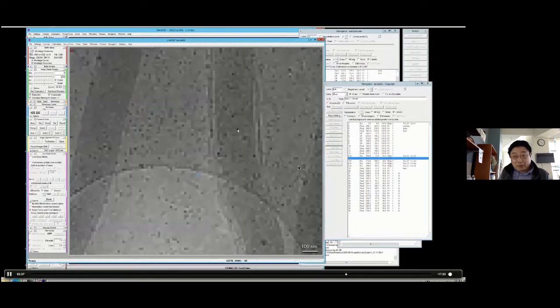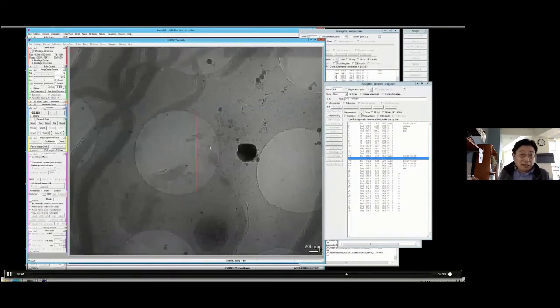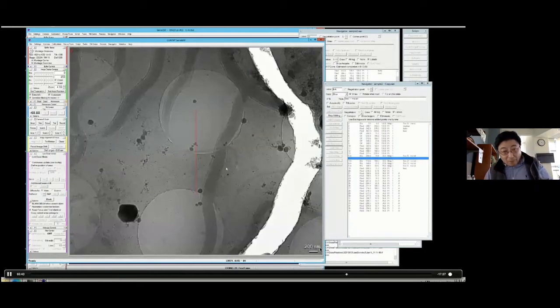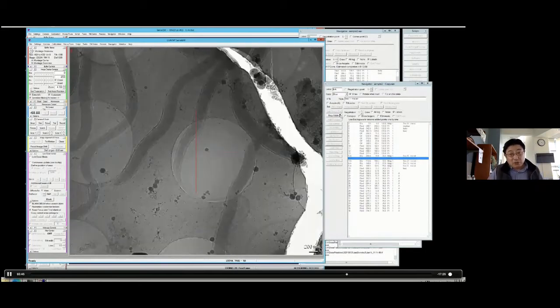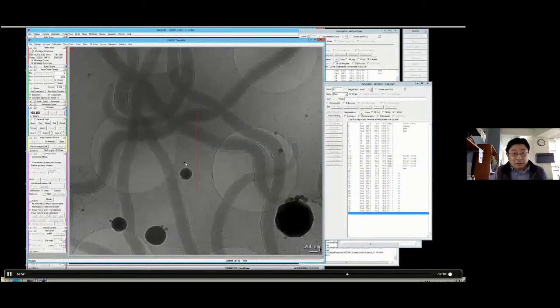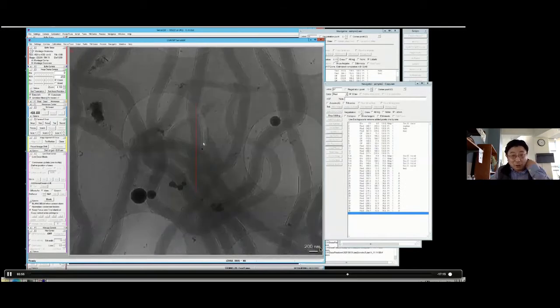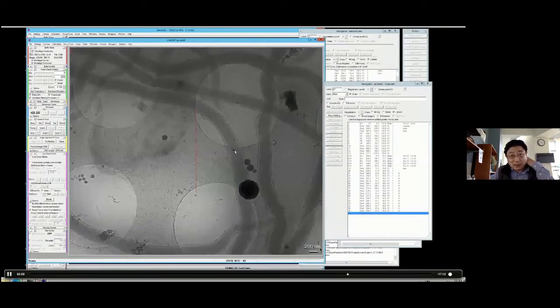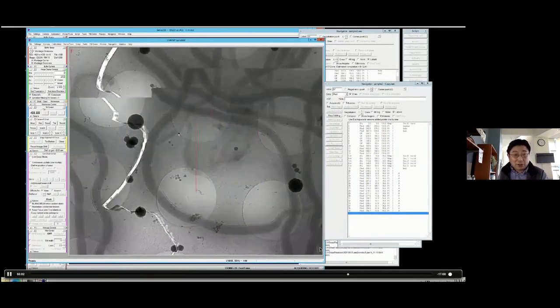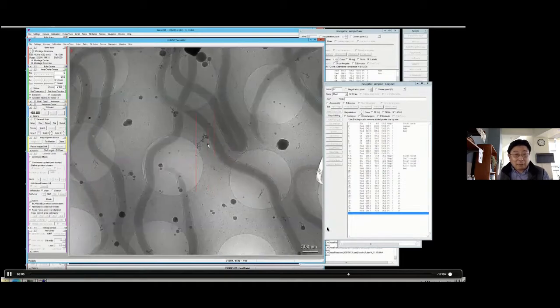In the meantime, you may notice that the background is still collecting data. So we are not using precious microscope time to just find the targets, and instead we are doing it in parallel. Then you can take a break, do whatever you want, and try to be more picky than you could otherwise be and find the best looking cells.